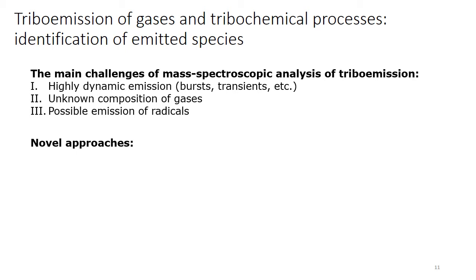So it should be analyzed very carefully to be sure that the spectrum of some molecule includes all the components in correct proportion, and that there is no contribution from radicals. If you see this contribution, it can give you very valuable information which cannot be obtained by other techniques, and this information can be obtained in situ and operando.